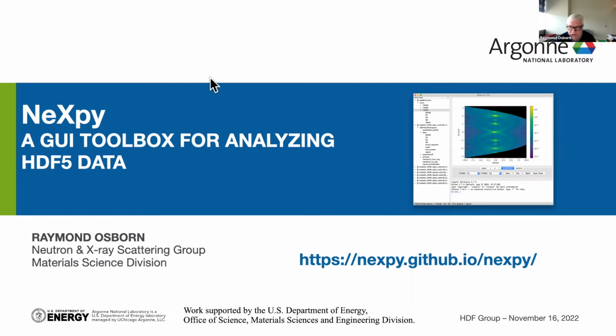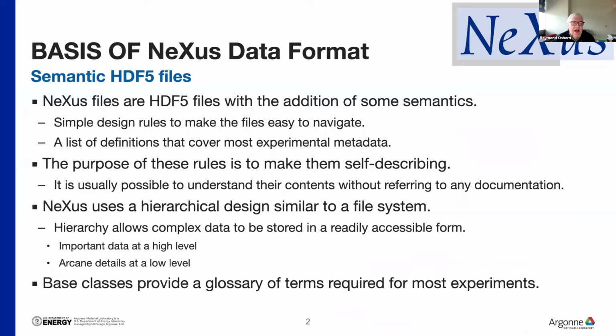Now, as I say, this talk is not about Nexus. But on the other hand, I think it won't be really comprehensible unless I say one or two things about Nexus. I'm not sure if you've had talks within the HDF5 group about Nexus specifically. So anyway, I've just got a couple of slides which explain a little bit about what it is.